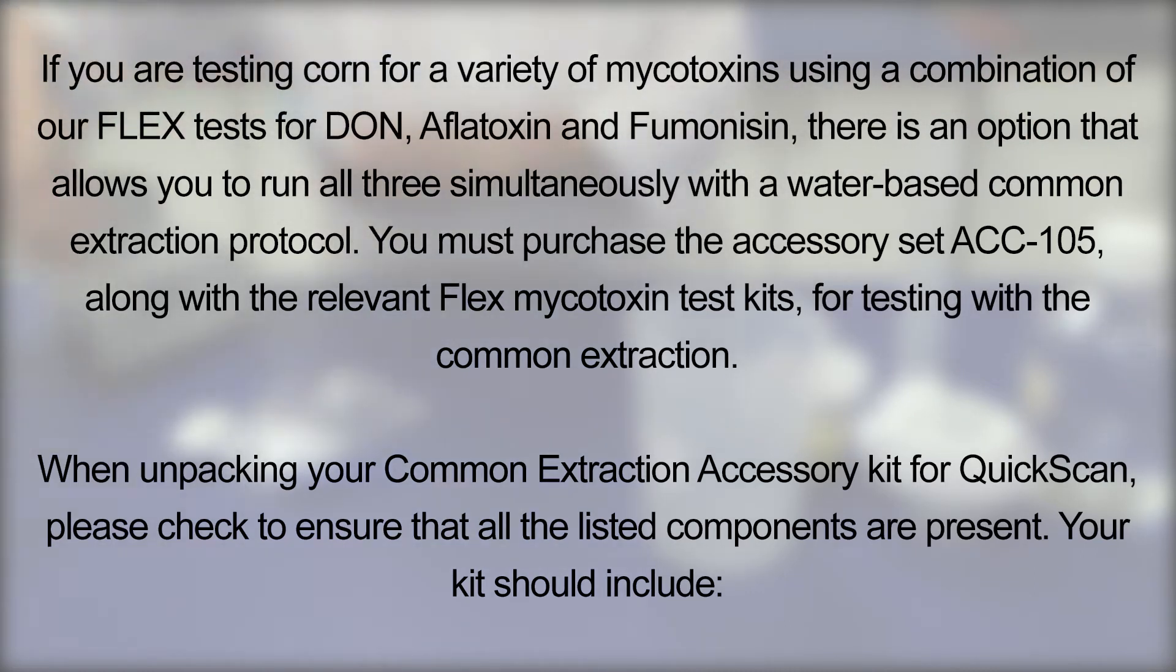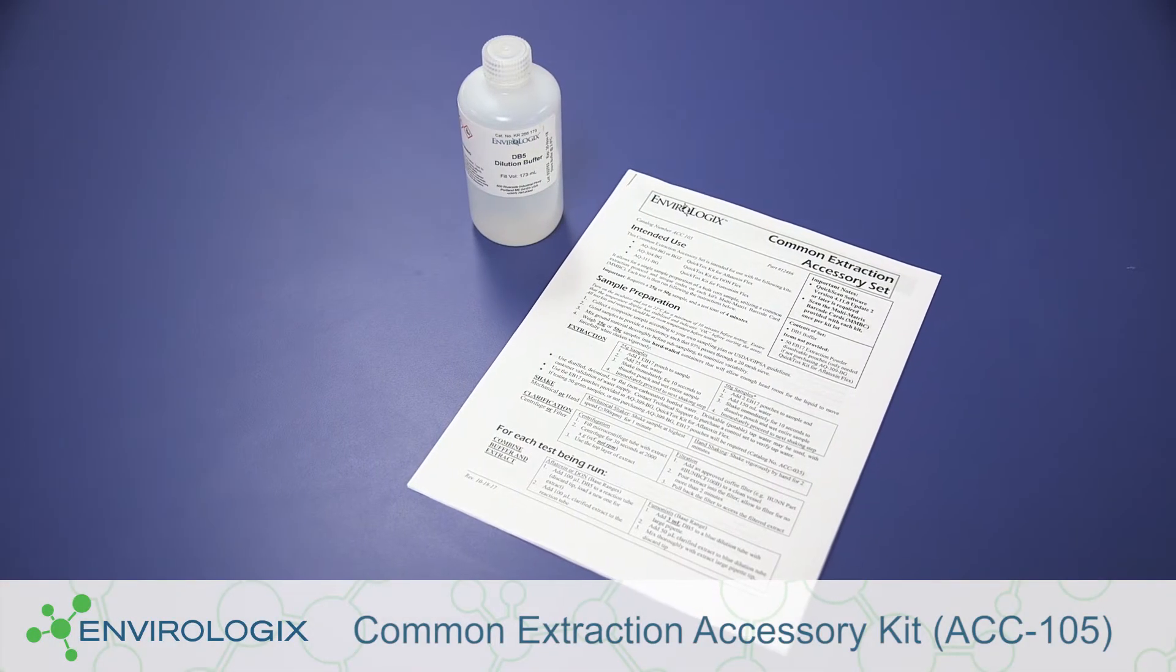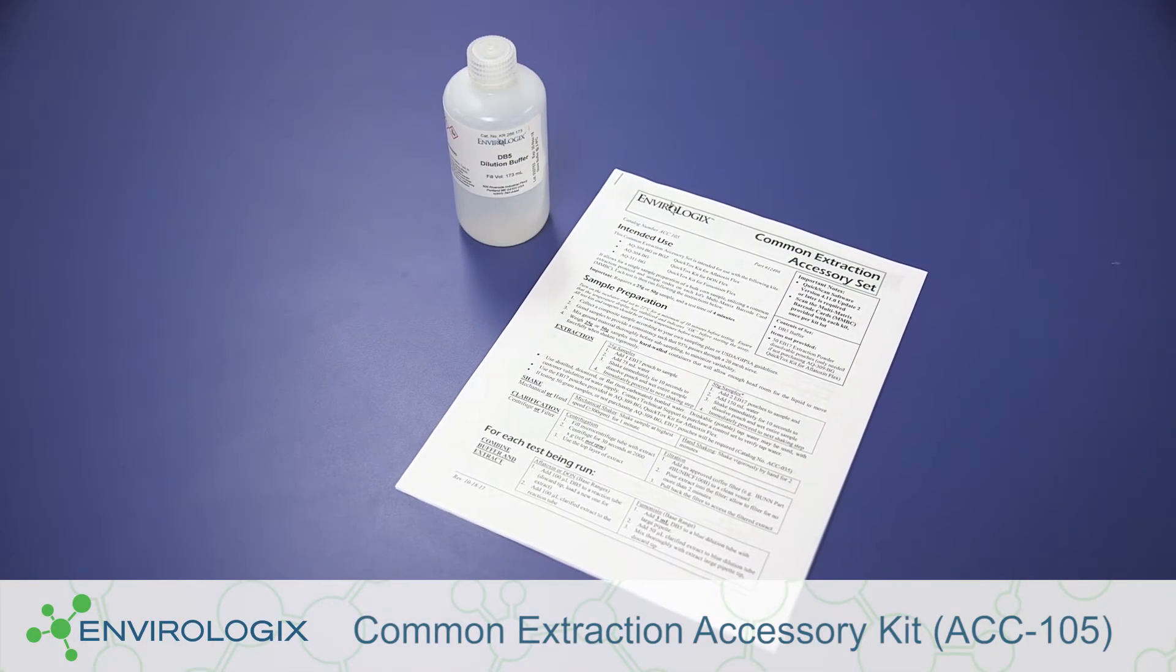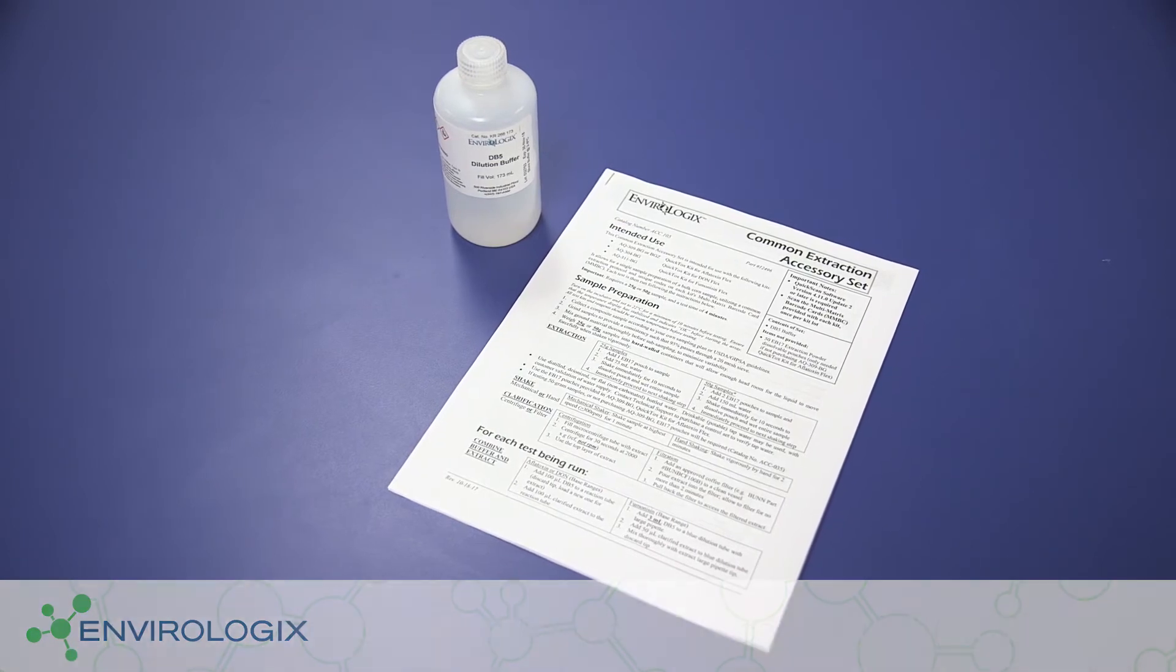When unpacking your common extraction accessory kit for QuickScan, please check to ensure that all the listed components are present. Your kit should include a product insert and a 173 milliliter bottle of DB5 buffer.